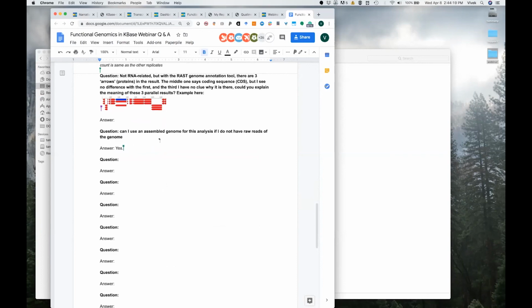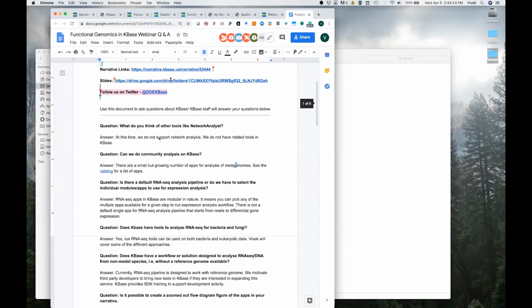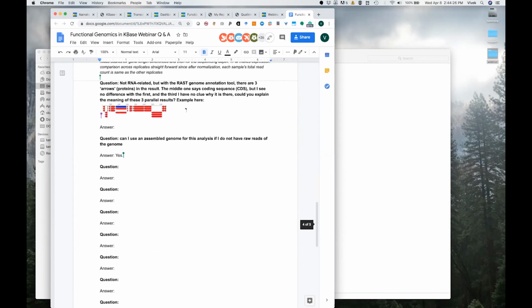Thank you. So I believe there's still one question open; most of the questions are answered. There's one question we can answer later. There's a question: can I use an assembled genome for this analysis if I do not have raw reads of the genome? I'm not sure if the raw reads means you need to have an assembly. This is a reference genome.